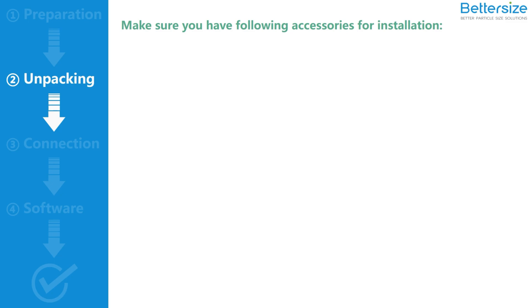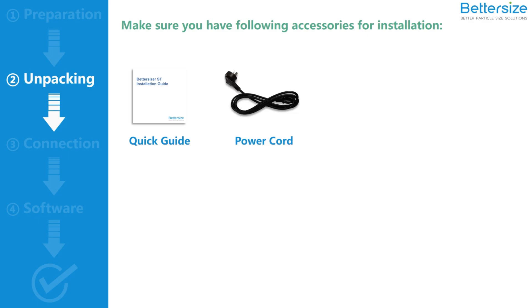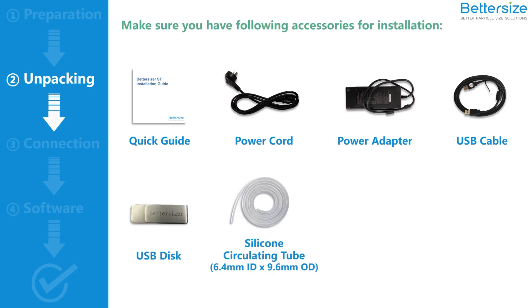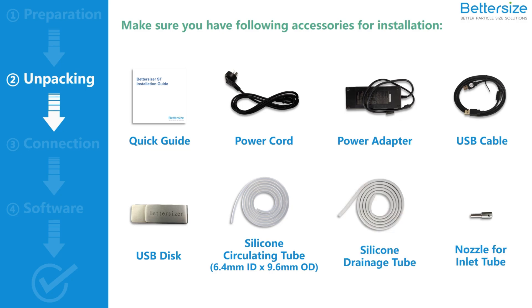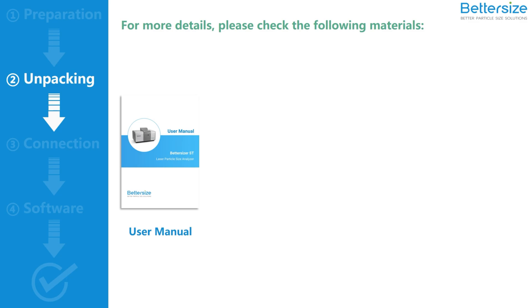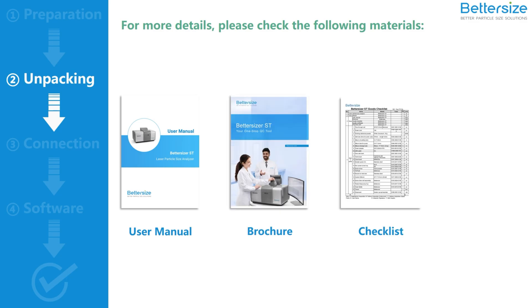Take the accessories out of the service kit and make sure you have the following accessories for the installation: a quick guide, a power cord, a power adapter, a USB cable, a USB disk, a silicon circulating tube, a silicon drainage tube, and a nozzle for the inlet tube. The following accessories are for maintenance instead of installation — keep them in the service kit and store it. You can also read the user manual, brochure, accessory checklist, and 100 Q&A booklet for more details about the Bettersizer ST and particle sizing.